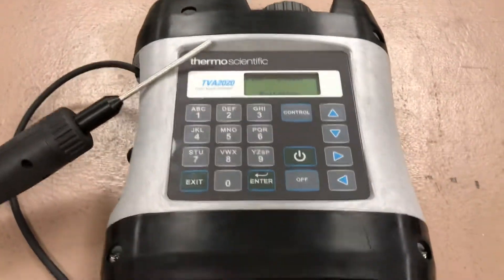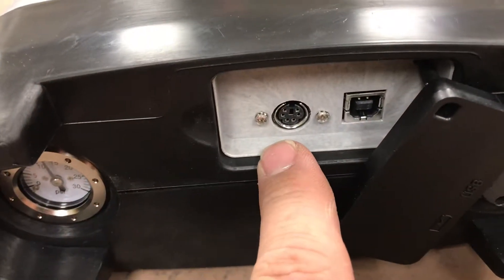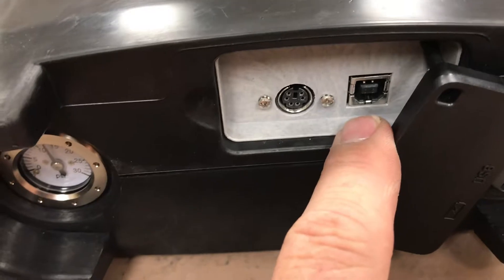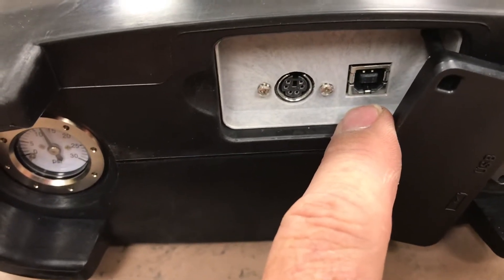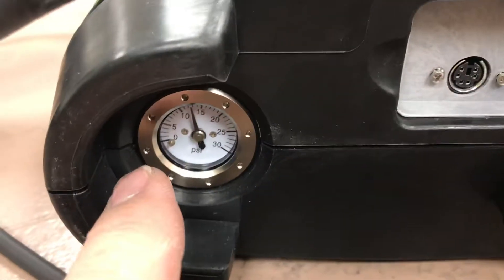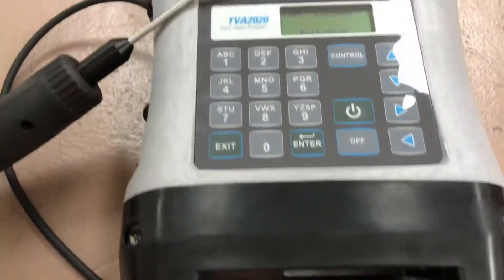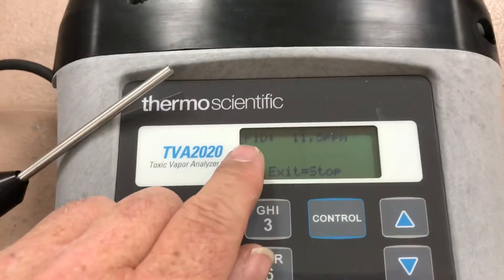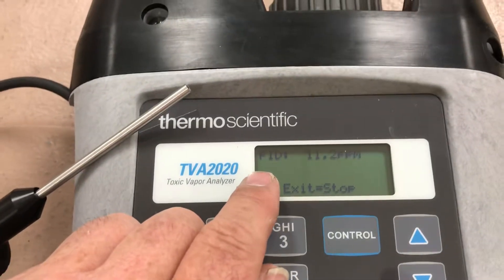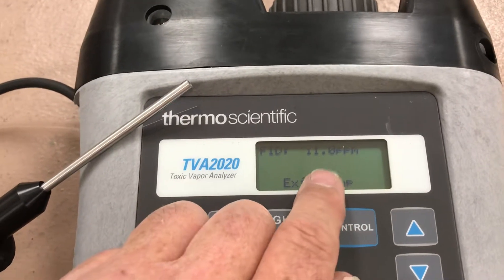This is the TVA 2020. On the bottom there is the battery charging port, which also handles data communications — really simple to get data off the unit onto your laptop. There's also a sample pressure readout in psi, so you know the pump is running and drawing sample through the probe. If the unit had both FID and PID, it would show a PID line underneath with a reading in ppm for that detector as well.